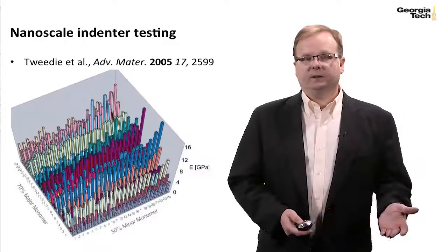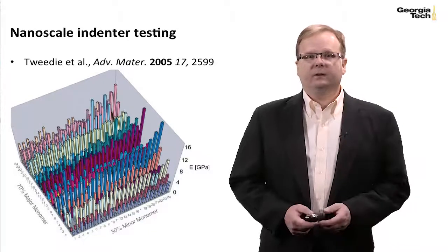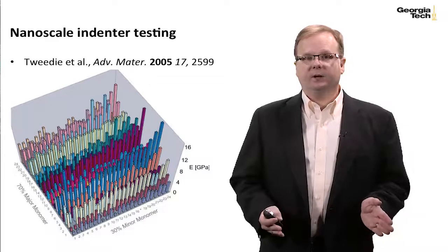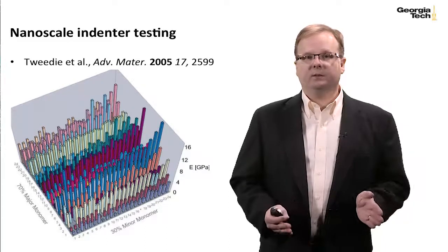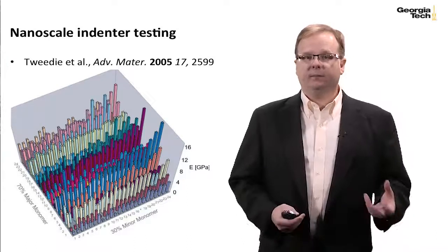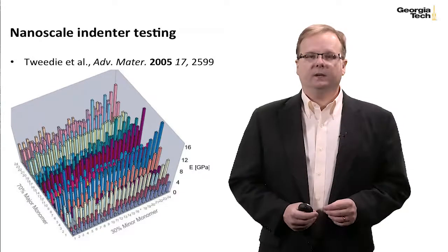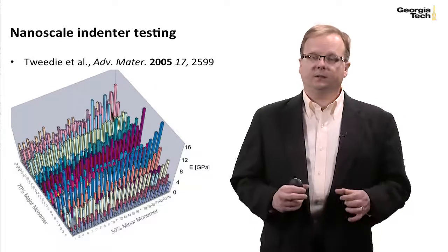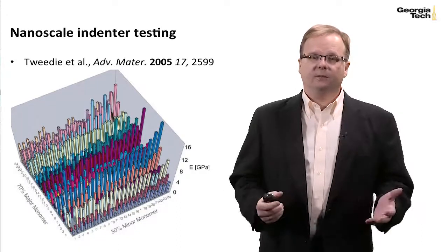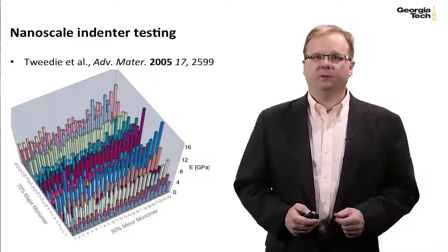So here for example, is the modulus with error bars measured on the 24 by 24 member library of combinations of two monomers. So a very large amount of data that can be collected here on one library. It can be collected in triplicate because on their single microscope slide they had 3 of these libraries made in triplicate. And you can see a really wide range of mechanical property modulus values was produced.